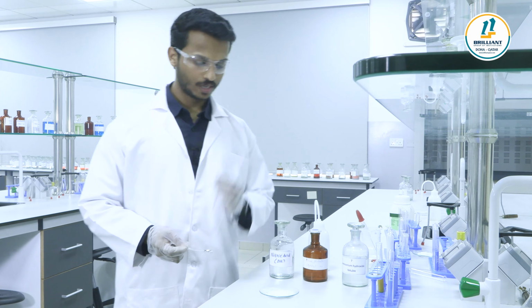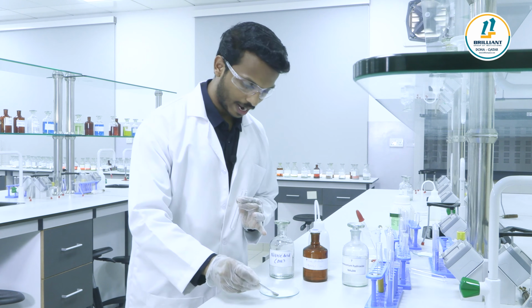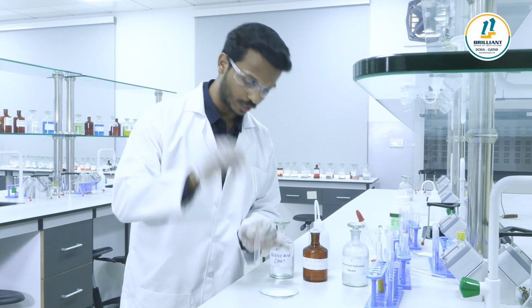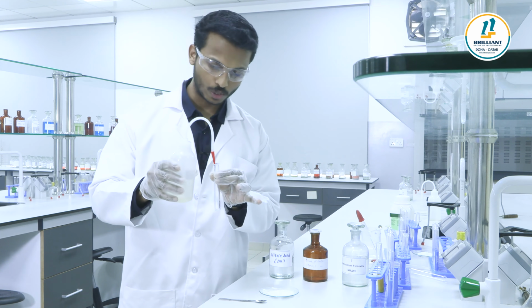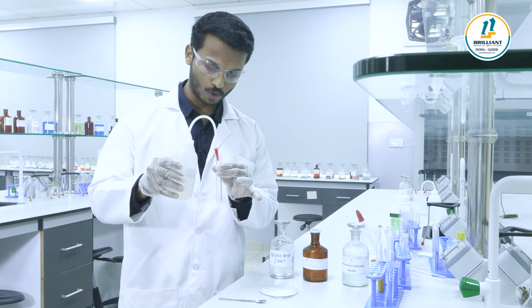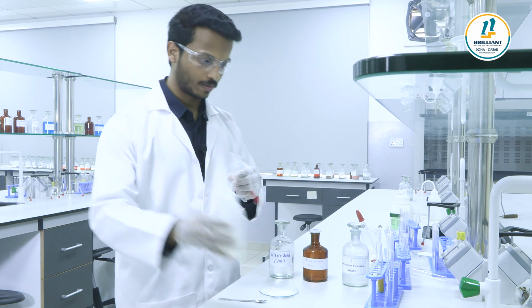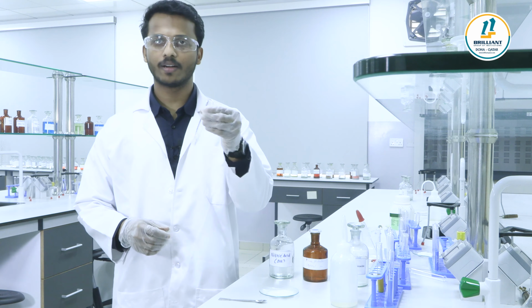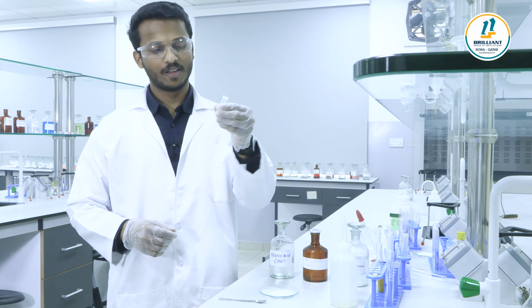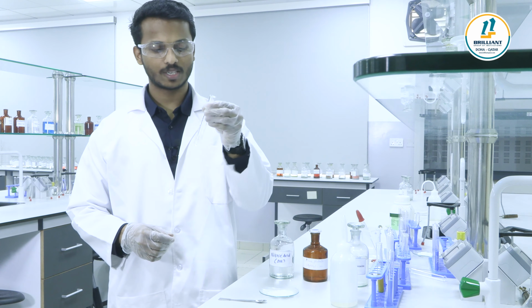Let's go to the confirmatory test of chloride ion. Take a test tube, add a pinch of salt into the test tube and make it a solution. Let me add some amount of water and mix it well. Make it a salt solution first.